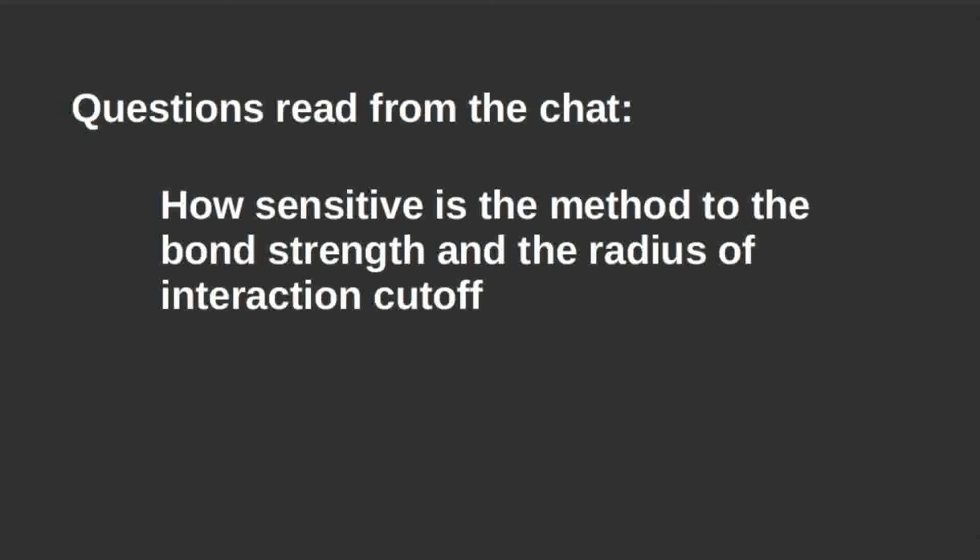But I agree this is not always easy, and that's why we have this automatic method to compute the cutoff, especially when you work with reference structures that come from data, which means reconstructions, or what I said, subtomogram averages. Then this cutoff is extremely important to set properly.